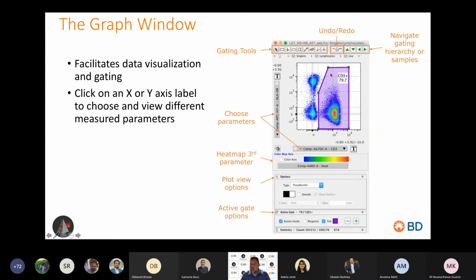There's a lot of display options that are available in not just the pseudo-color dot plots, and you can turn those display options on by expanding this options bar down here. It expands out, and there's a drop-down type of graph menu. Within that, there are a bunch of different options to visualize these with different color schemes and gradients. I'll show that on the next slide here.